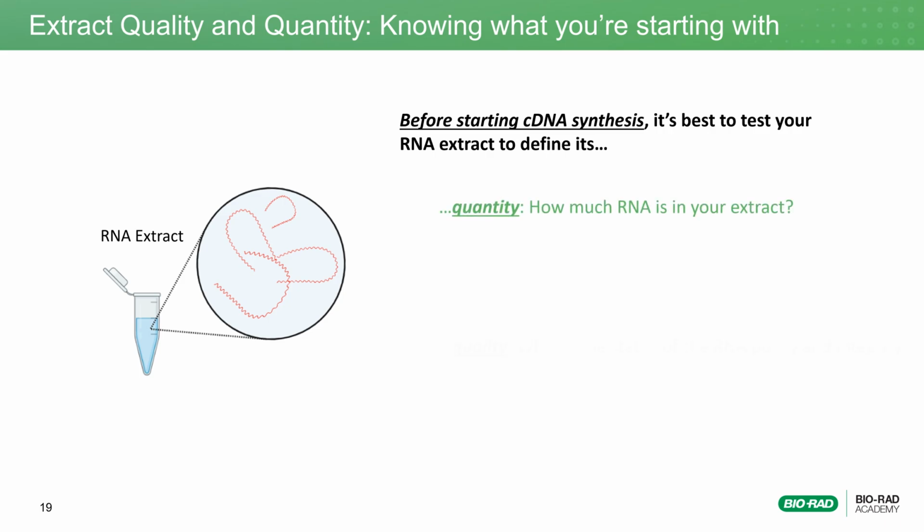Alternatively, it would be just as frustrating to capture an abundance of fragmented transcripts accompanied with several co-purified PCR inhibitors. During these next few slides, we'll uncover common methods to qualify your RNA sample in an effort to validate the quality and quantity before investing time, money, and energy into continuing the remaining steps in RT-qPCR.